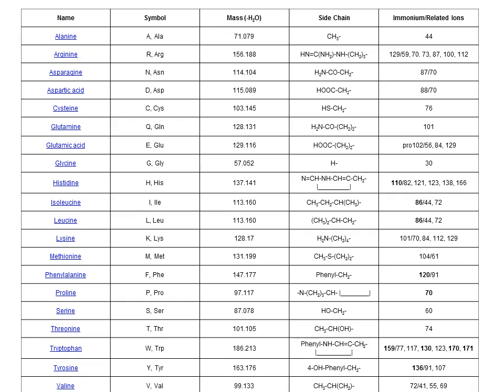In the next lecture we're going to discuss how to do this in an automated fashion, because to do this by calculator for thousands upon thousands of spectra is just completely impractical.